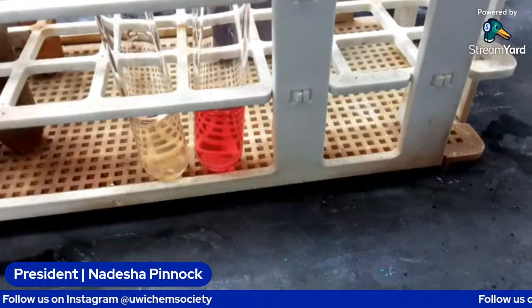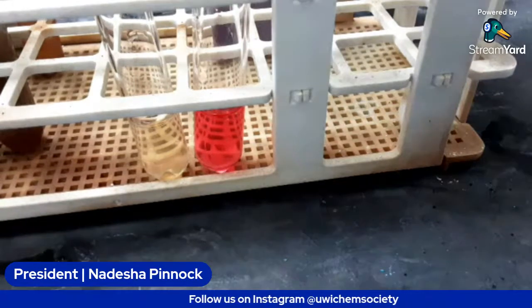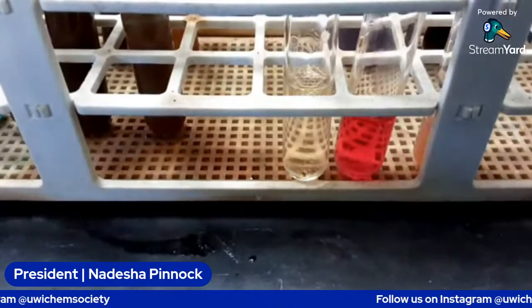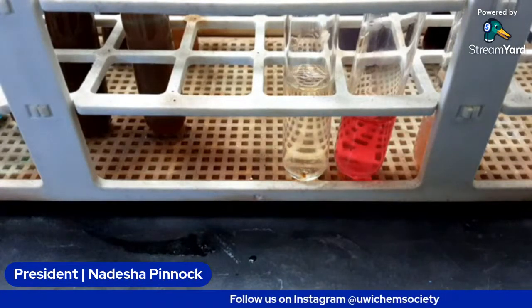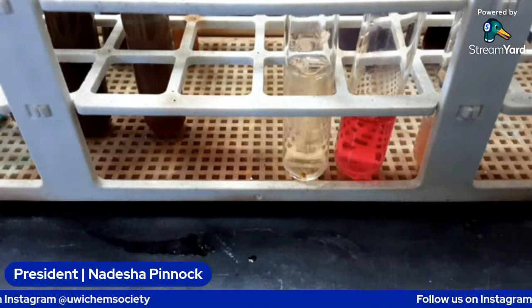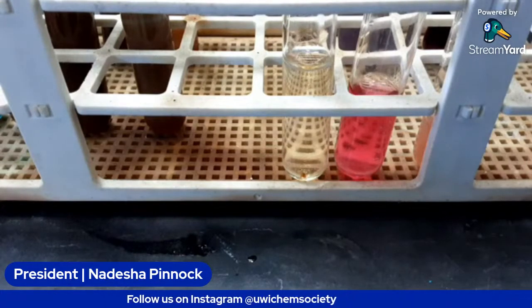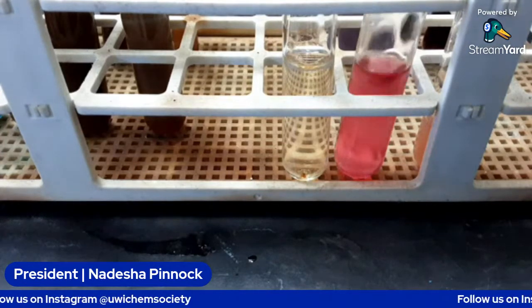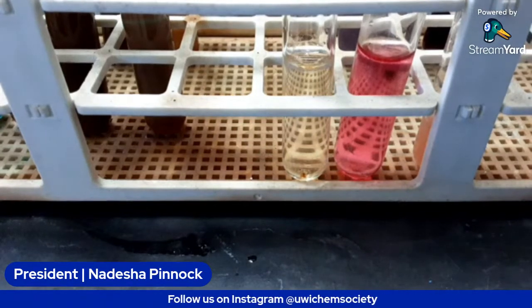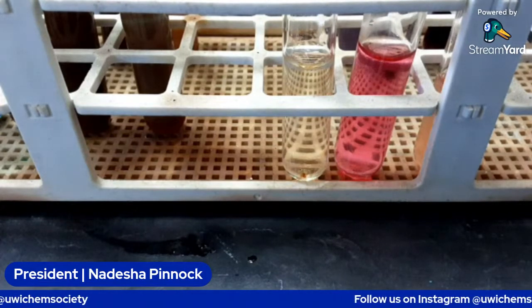So we're going to do the sucrose first. We're going to add about 2 mils of acid, or 1.5, I think, is the maximum to do that. We'll follow with blue litmus paper.